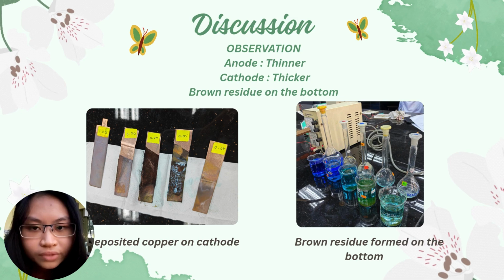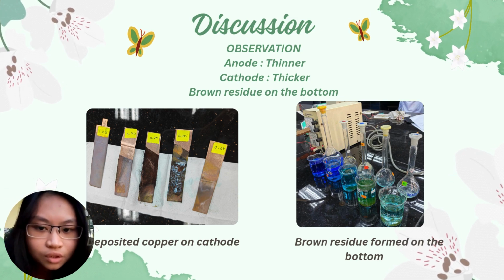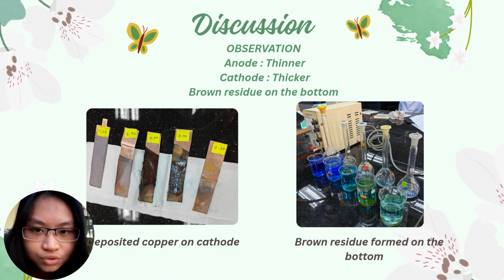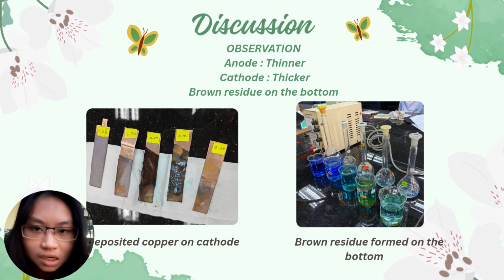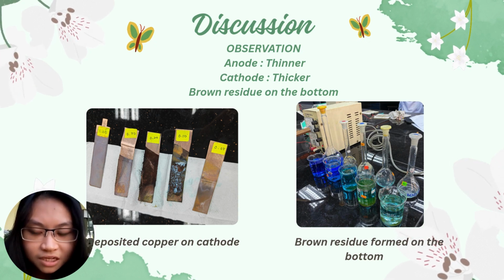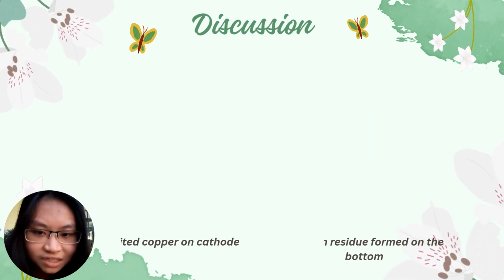This is because the same current was applied for all concentrations, but for the lower concentration, the same current used may be considered too high for them. So there are few ions to carry the charge in the solution. This caused the plating to become rough and uneven.